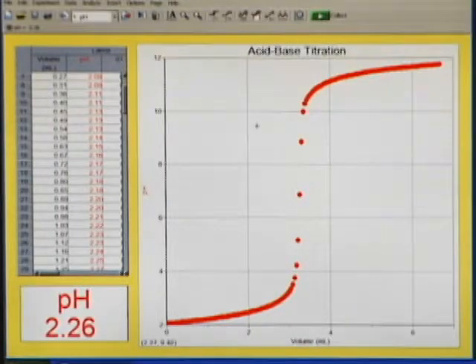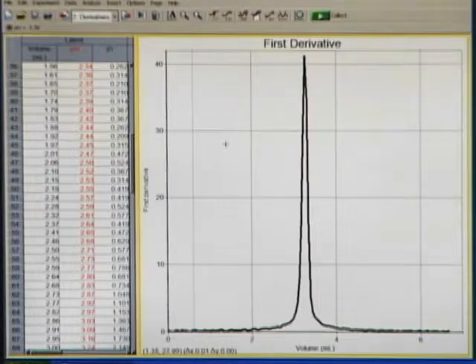So what we would do is find the first derivative of this data, and in the Logger Pro file, we've already done that for you on page two. So up here in the toolbar, I'm going to click on the Next Page button, which takes us to the first derivative.